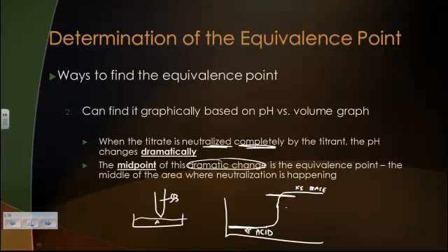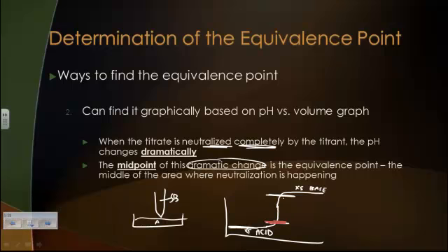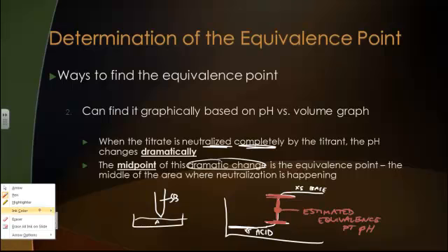And if you take the midpoint of that vertical jump there, right, the midpoint is an estimated equivalence point pH. So that's nice.